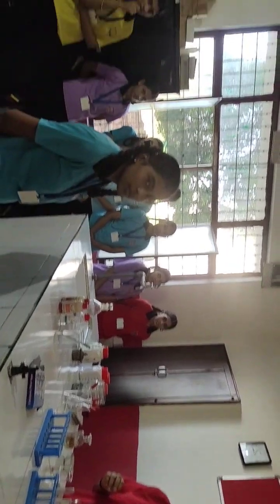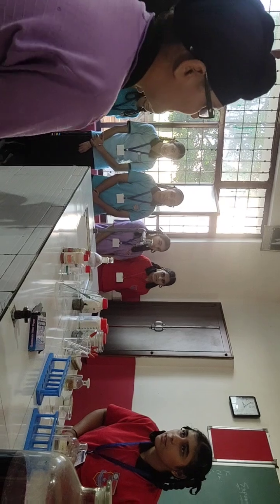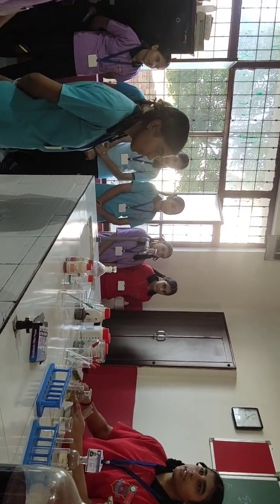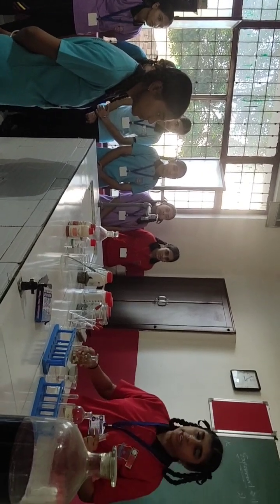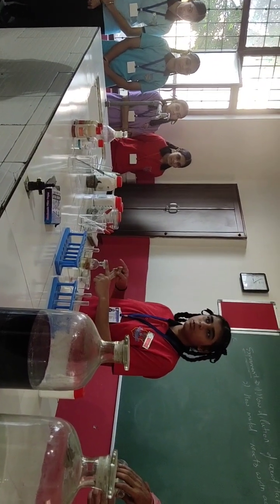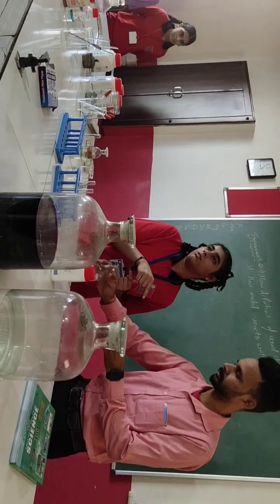Excuse me, Anshita, one question: why do we take only dilute HCl for this experiment? Why have we not taken concentrated HCl for this one? Because the concentration level of concentrated acid is much higher and it will cause heat, and that's why we use dilute acid.